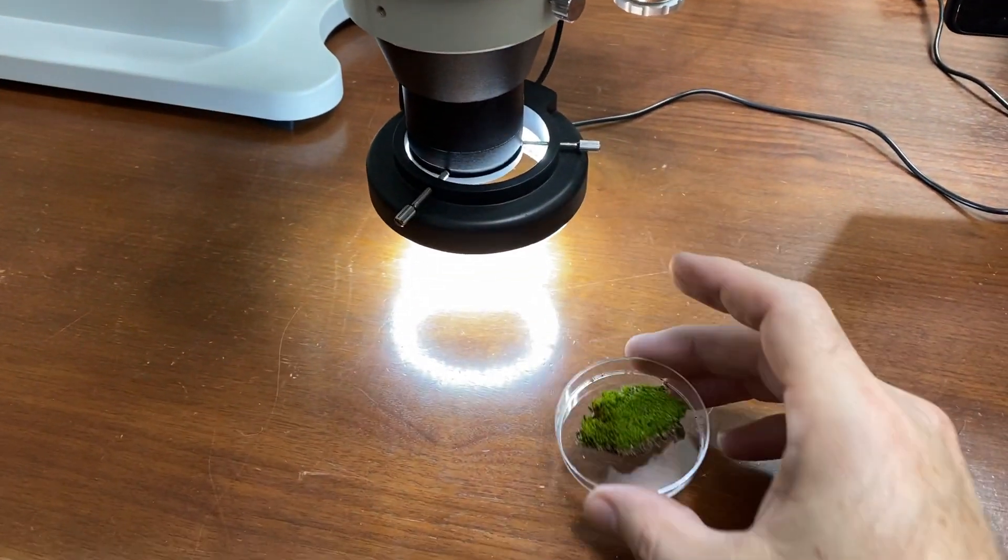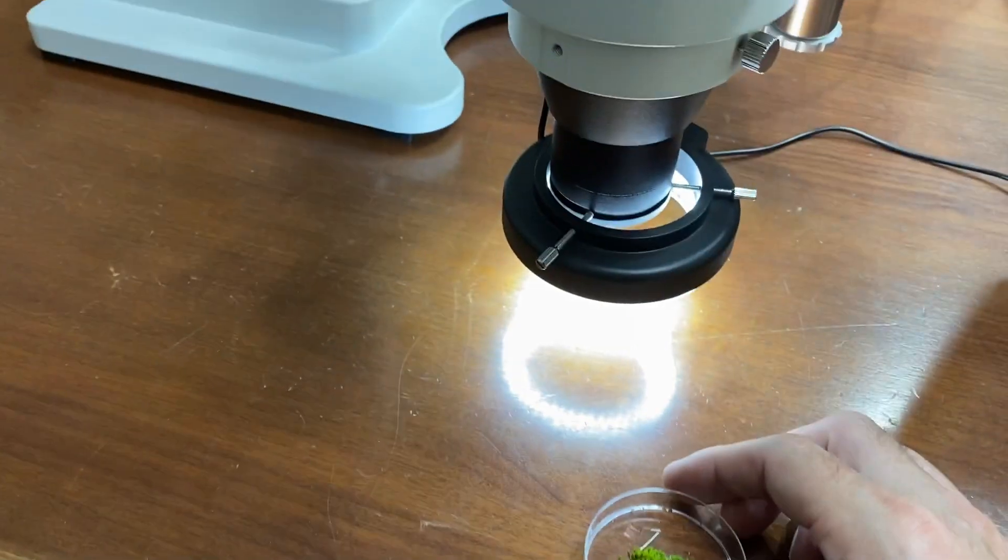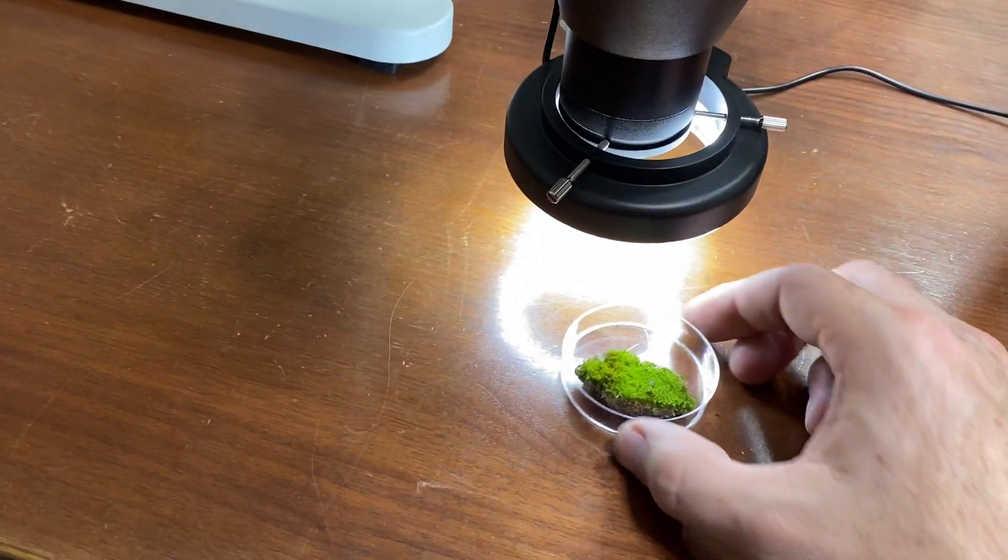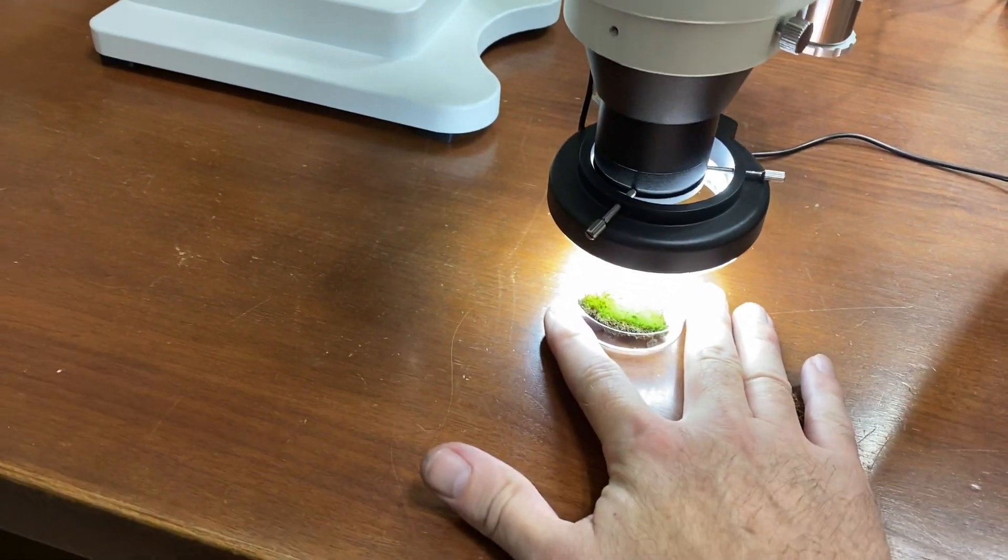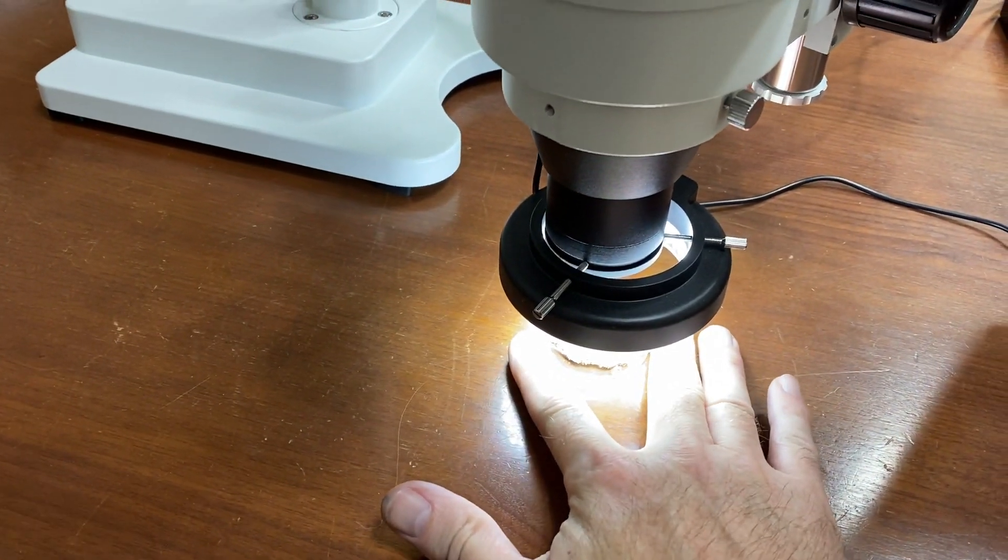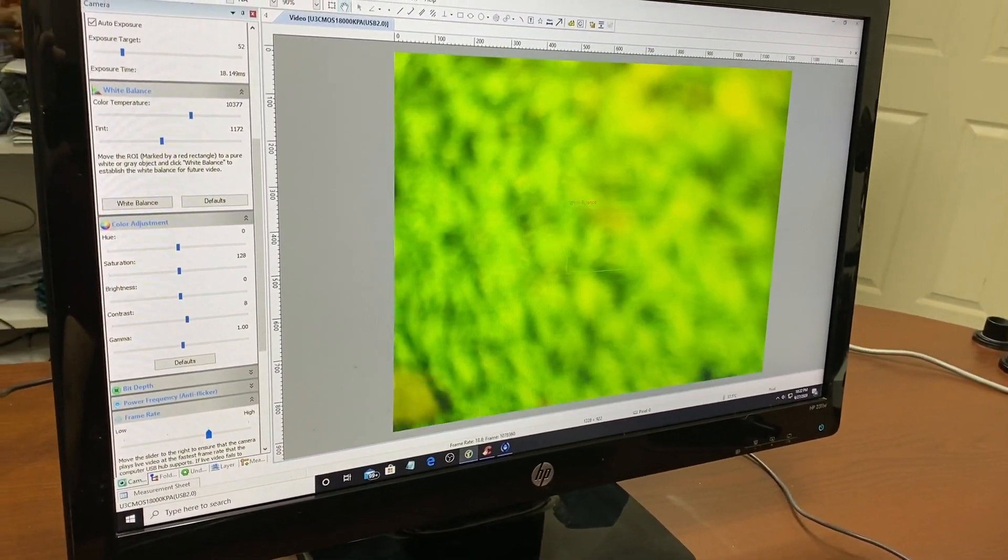Alright, so I'm going to put the moss under the stereo microscope here. This is an AM scope microscope. I'm just going to slide it right under there like so. And over here you can see that it shows up on the monitor.